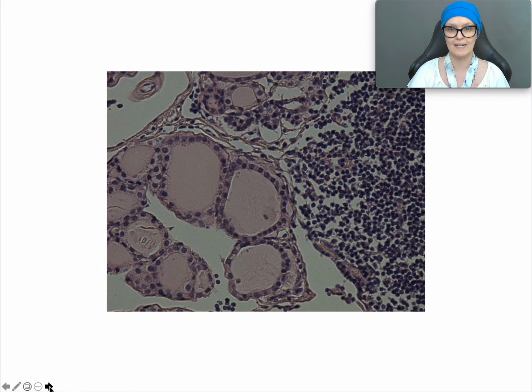Next slide. There are actually two glands shown on this slide. So let's start with this part here with these circles, all these little spheres here. This is the thyroid gland. And it is, I think, the easiest one because it's visually distinctive. It's got these balls made out of cells with a fluid center. And we will name all of those bits. So name the organ.